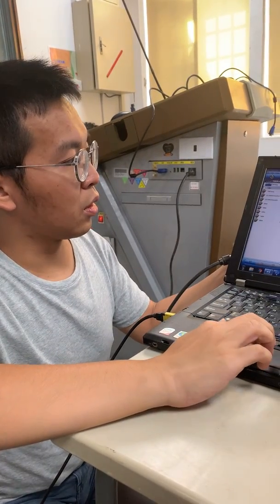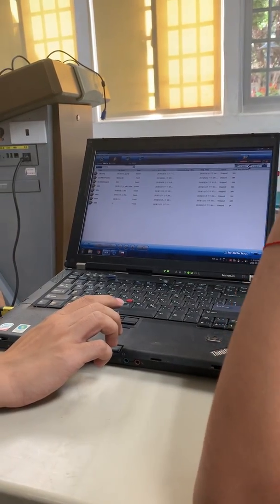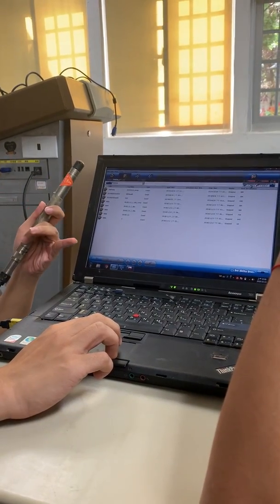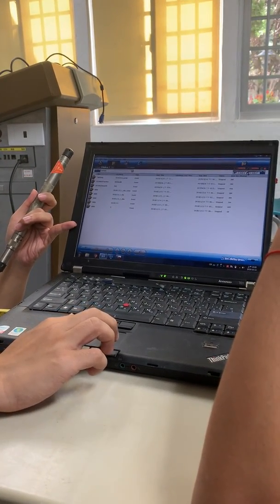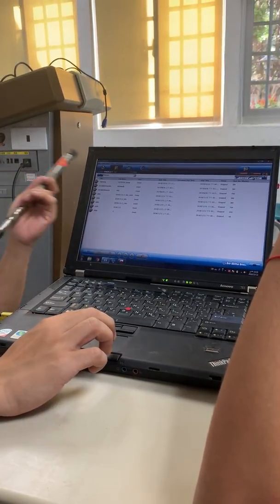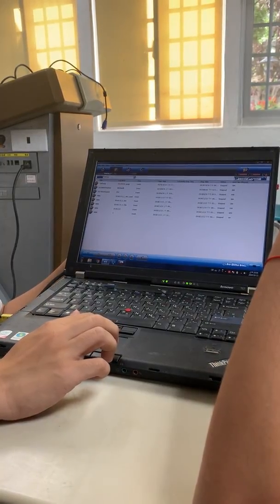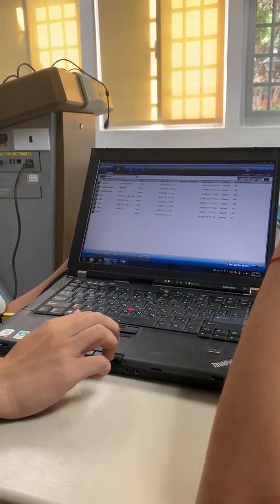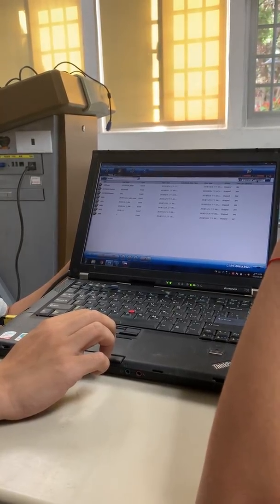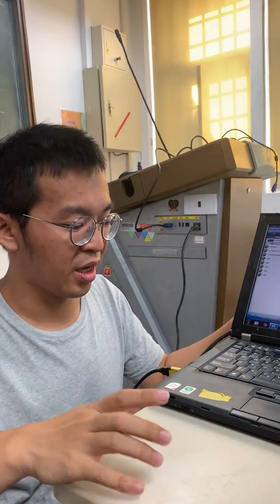Here is the time shown in the Level 2 device, and this is the time on the computer. If they are not the same, use this button to refresh and sync them. Make sure every computer's time is the same when you do the experiment, or you will have mistakes in the time data.